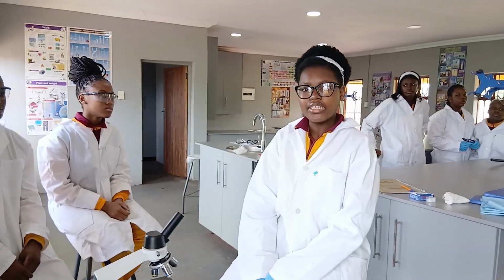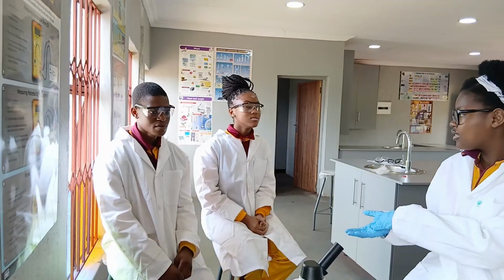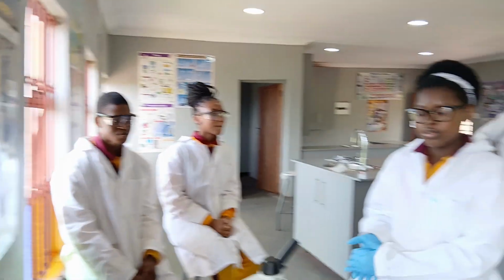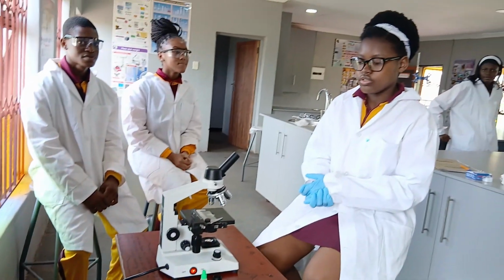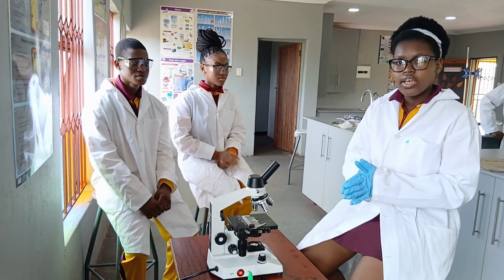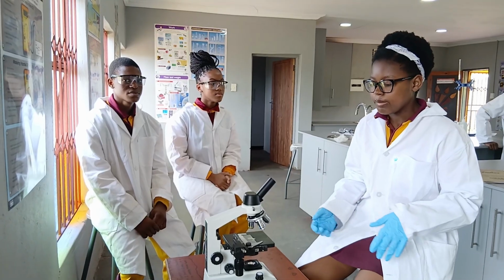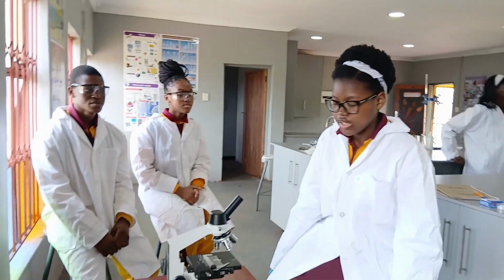To you all, my name is Kuraranazo and I'm here with my group members, and we'll be doing the introduction of the microscope. First we have to understand that the microscope is a magnifying glass with a double convex lens used to see microorganisms that cannot be seen with the naked eye.